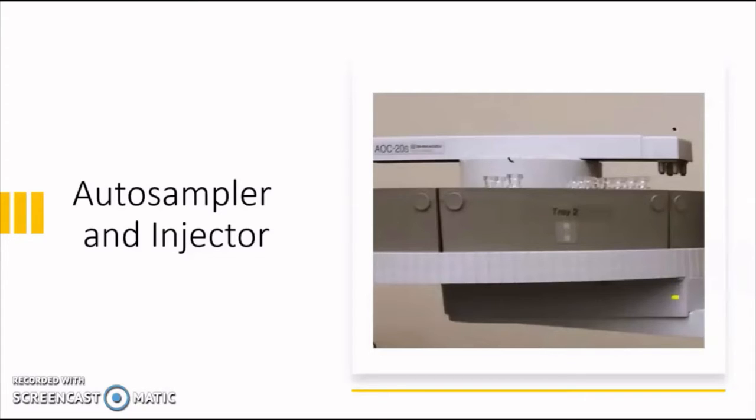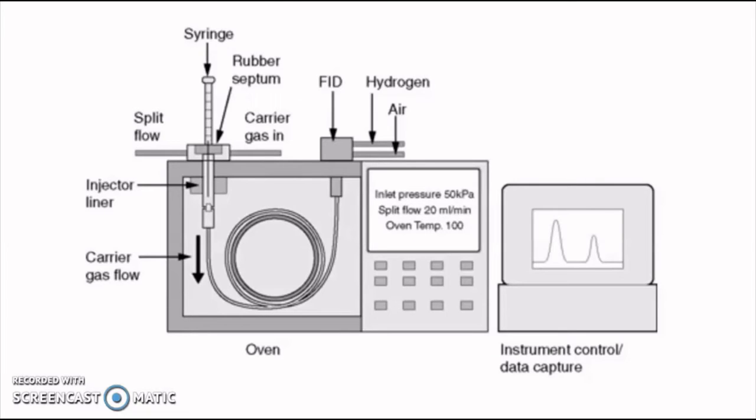If you remember from the previous video, the Headspace autosampler includes the heater, mixer, syringe, and injection port all in one complete module. The autosampler delivers the sample vial to the injection port where the sample syringe aspirates our sample. Then the sample syringe pierces the rubber septum of the injection port and injects the sample. There is a glass liner on the inside of this module, as we can see here, where the sample is collected, heated, and mixed with the carrier gases.